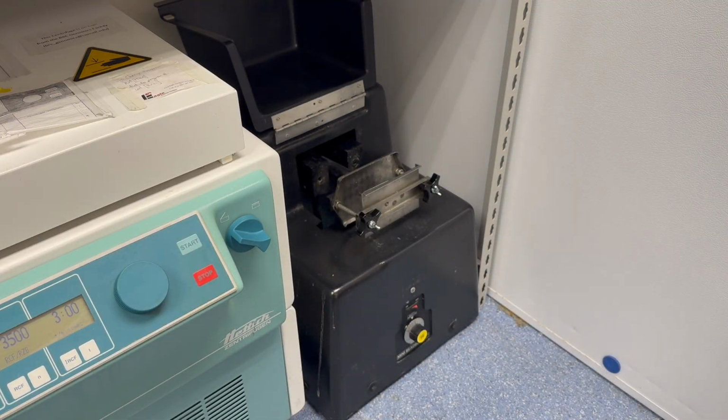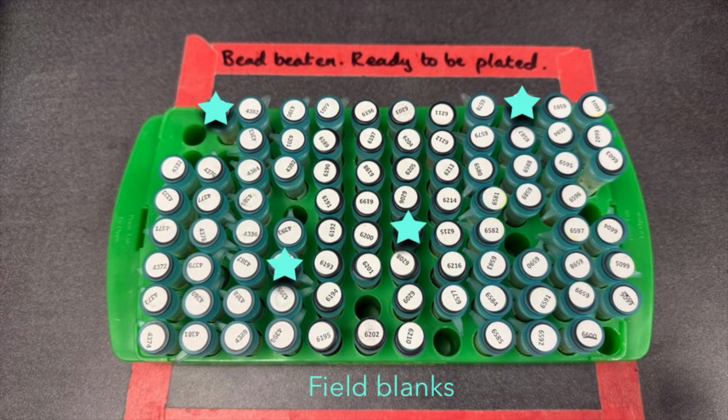At this stage, we're going to treat our field blanks just like our samples, so they're included in this plate of samples here. I do my extractions in 96 well plates, but I don't put all the samples from one colony on one plate. Rather, I mix them up amongst plates in order to minimize batch effects.